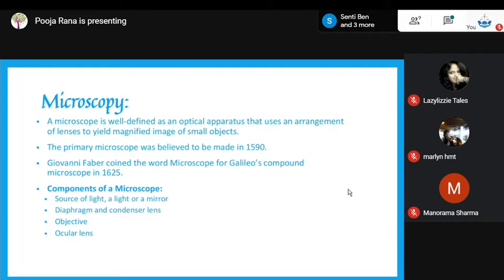These two words are a bit tricky. And they might be a bit confusing also. But what is microphotography and what is photomicrography? There is a minute difference. And if you observe these two terms, you can easily tell what is microphotography and what is photomicrography. Anybody? Let's just give it a try. We are not here to prove somebody right or wrong, we are here to discuss things so that we can get an idea.